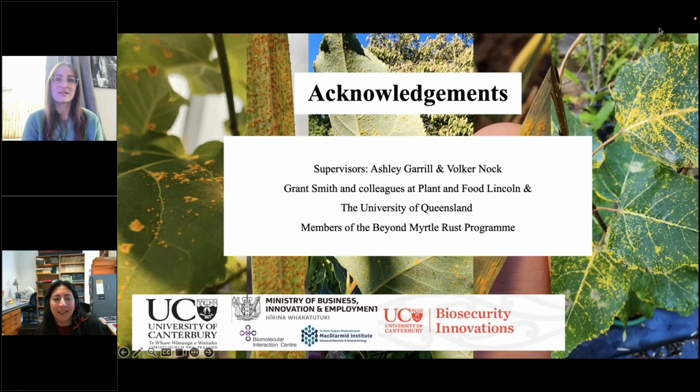So hopefully over the next month or two, I'll be doing a lot of those experiments that I've done for the other rusts with Myrtle Rust, and seeing how they respond to those surfaces, and how long they can grow on just those surfaces. But I'll also try and get them to go in the lab on a chip and see if they're happy in there, because they grow on the PDMS easier than the other rusts actually, which is just another demonstration of how hardy they are in comparison to the others.